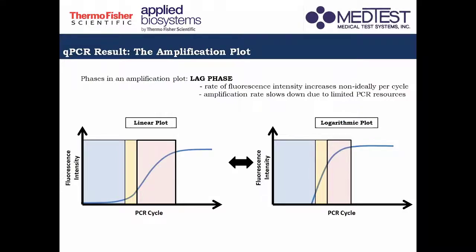And this is because your reagents in your PCR are depleting. And when it does, the amplification rate slows down. No, so you can observe it in your plot, wherein in the linear plot, instead na pataas siya ng pataas, nagsistart na siyang nagka-curve, no? And this is also depicted in your logarithmic plot. So parang nagsa-slow down na siya. Ganun.